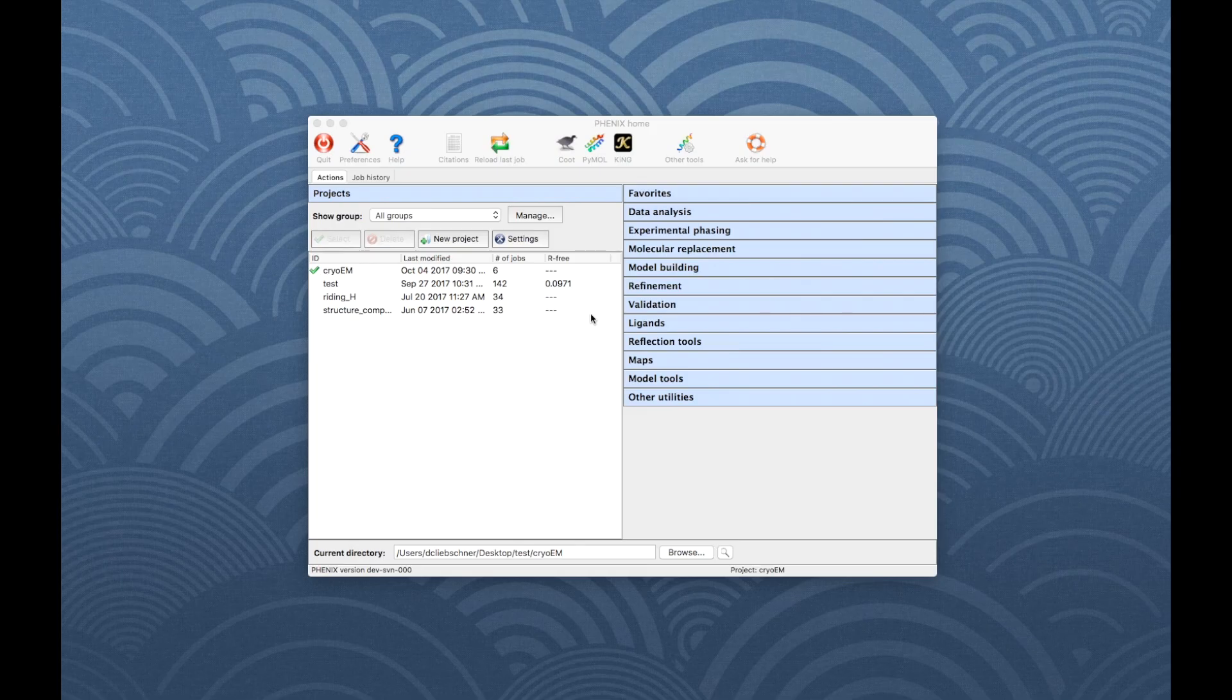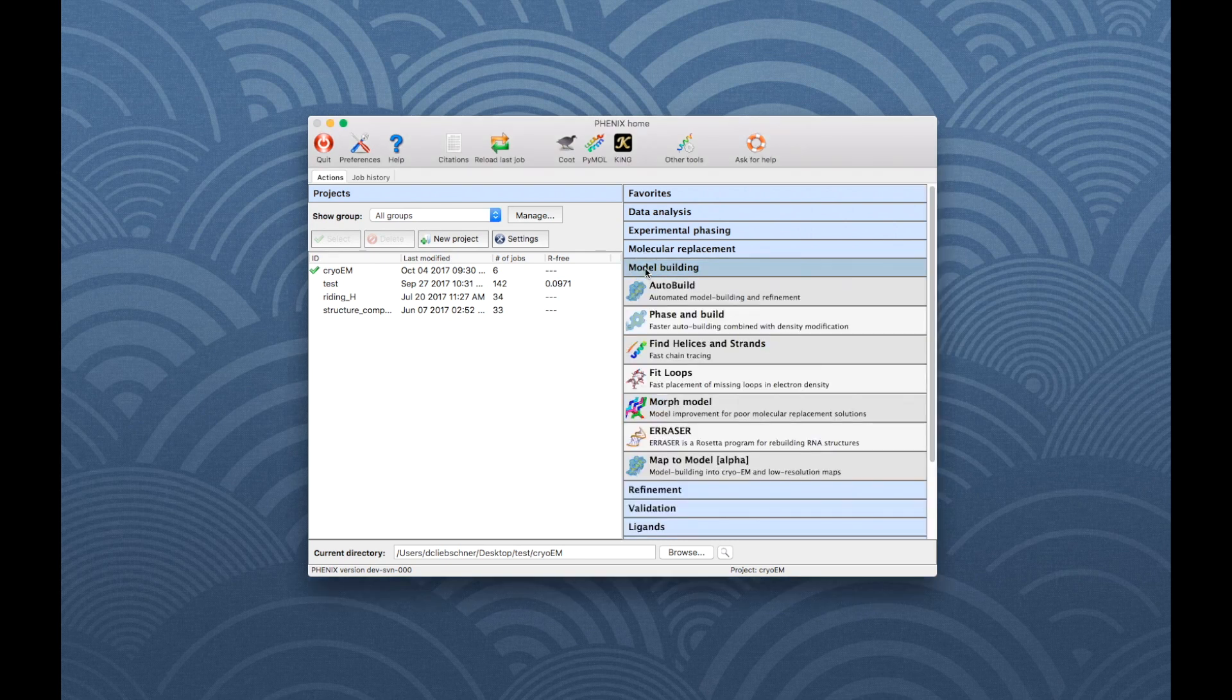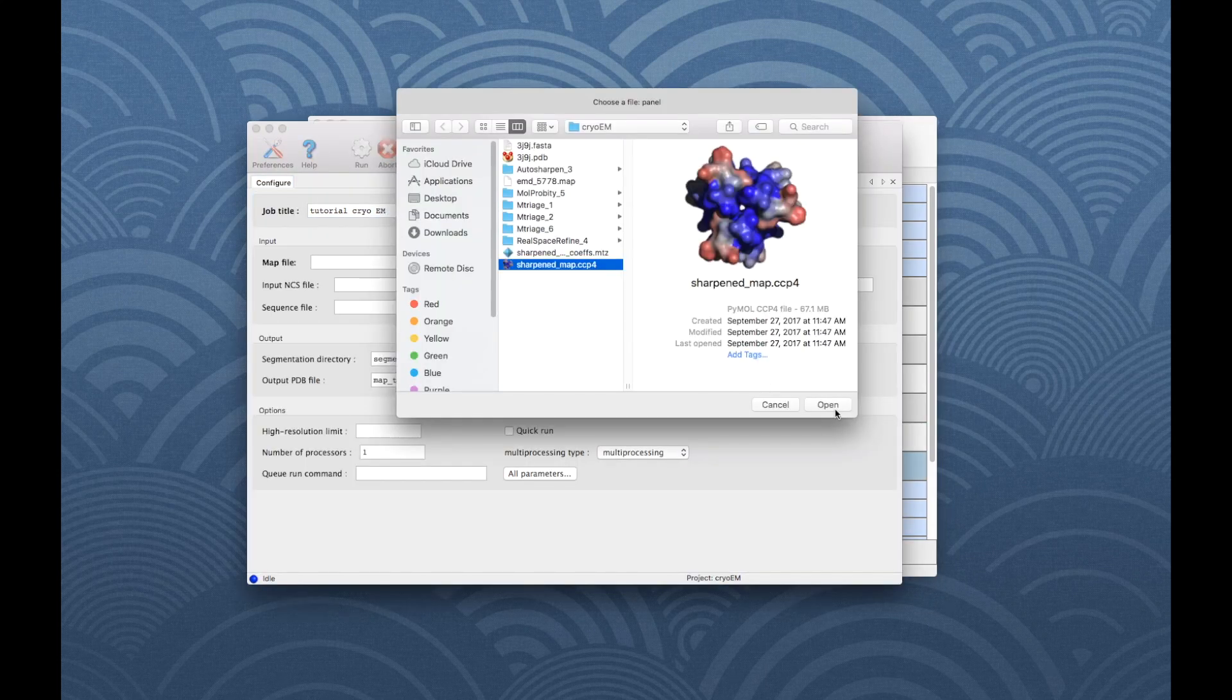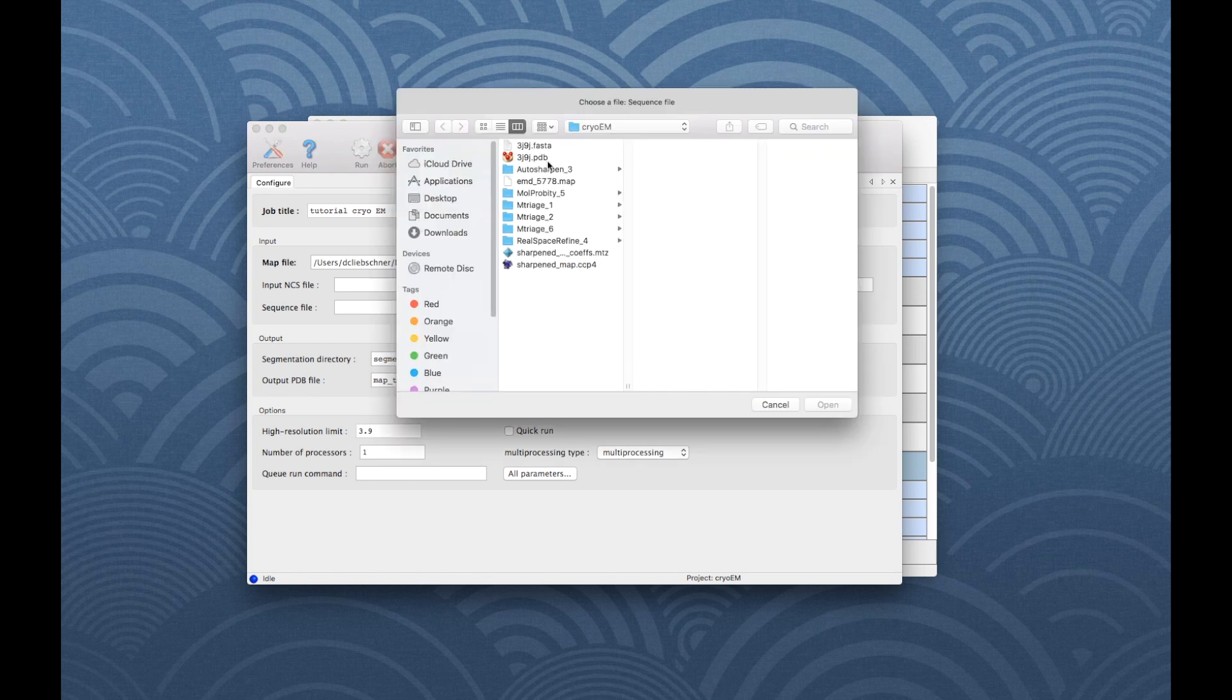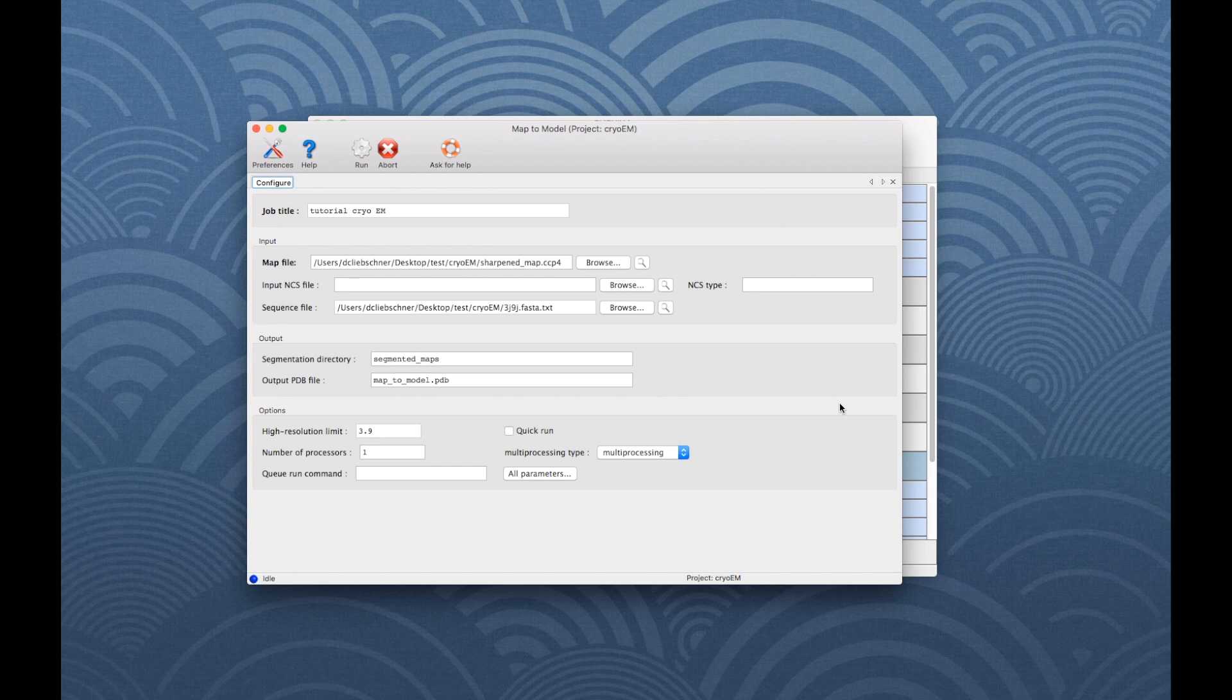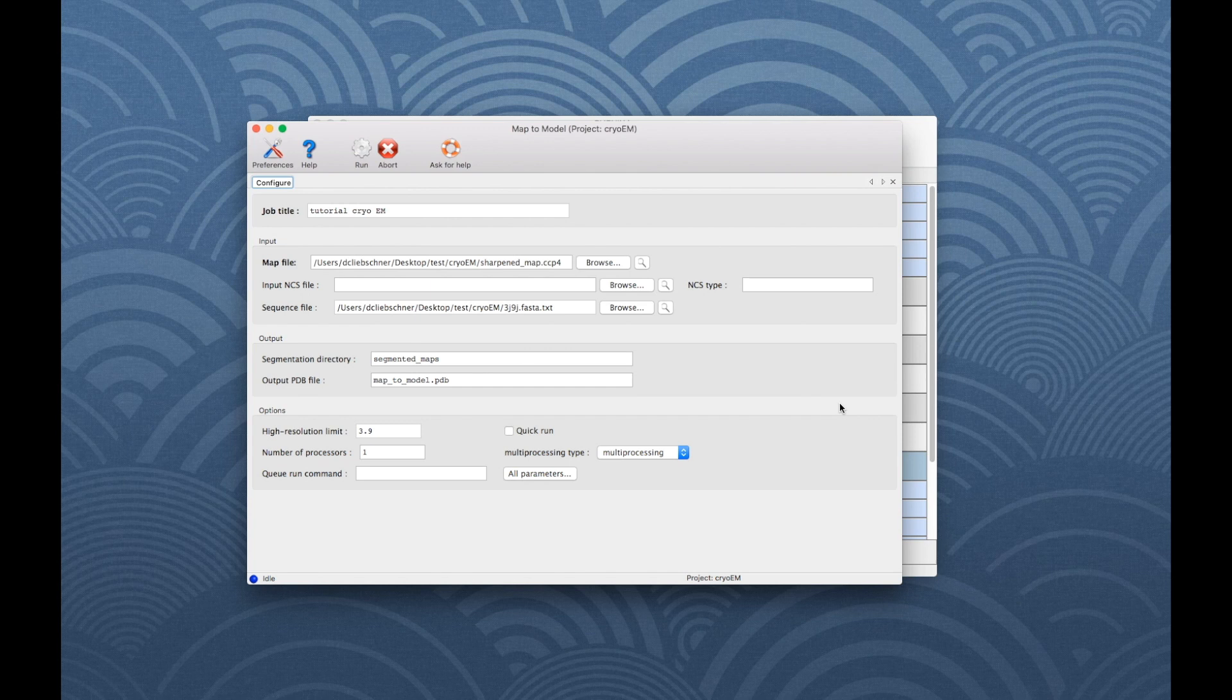If no model is available, it can be built automatically into the map. To open Map to Model, go to the category Model Building in the main window. Recommended inputs are the sharpened map file, the high resolution limit, a sequence file and, if applicable, the symmetry used in reconstruction. Please note that typical run times can be very long. If you have a multiprocessor machine, you can specify the number of processes in the input settings, which will speed up the runtime.